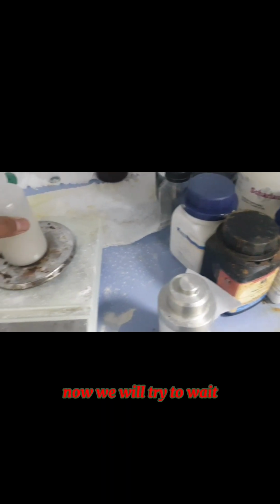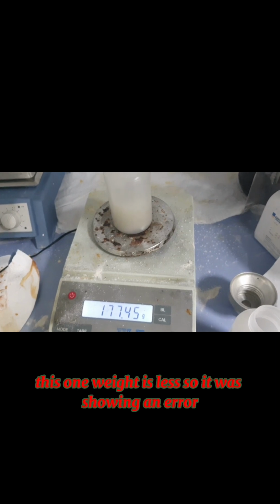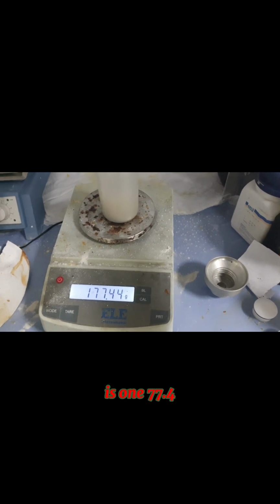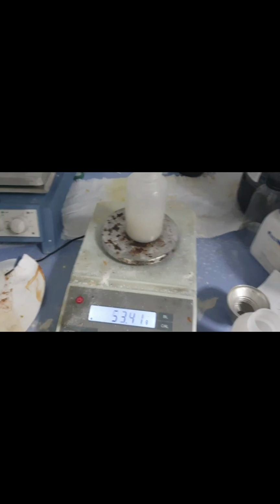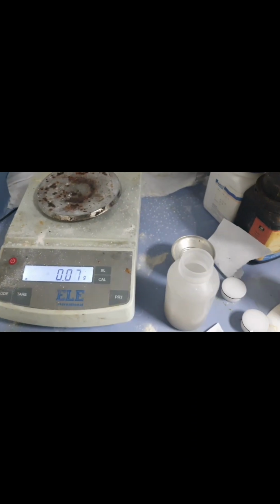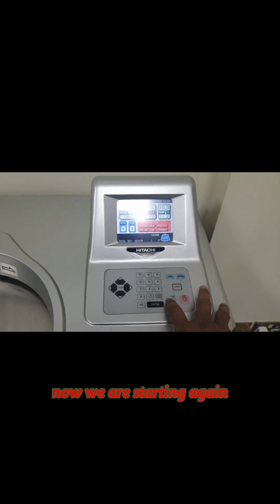Now we will try to weigh it. You see the weight is 185.86. This one's weight is less, so it was showing an error. The weight after removing some solution is 177.4. Now we will check the weight of this. It's 173.37. Weights are similar. Now we are starting again.